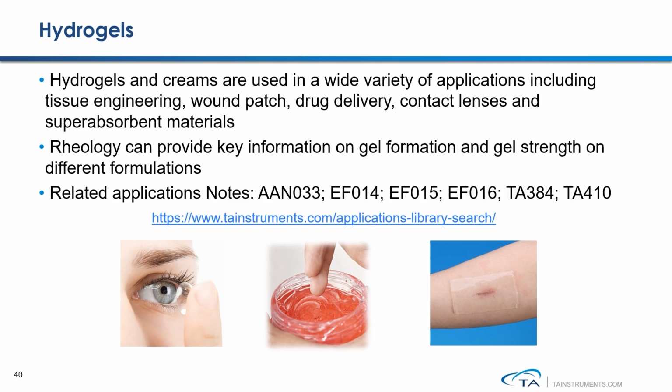Rheology measurement can help to quantitatively measure the gel strengths and also compare their elasticity. If you log on to the TA Instruments website, you should be able to find a lot of very helpful application notes, and short papers that talk about how we use rheology or even DMA to evaluate the viscoelastic property of soft solid or gel samples.